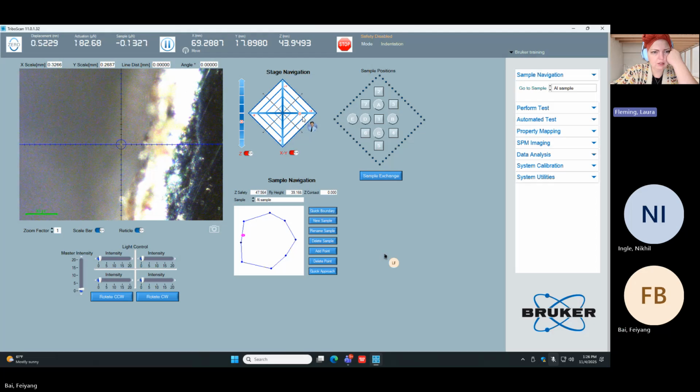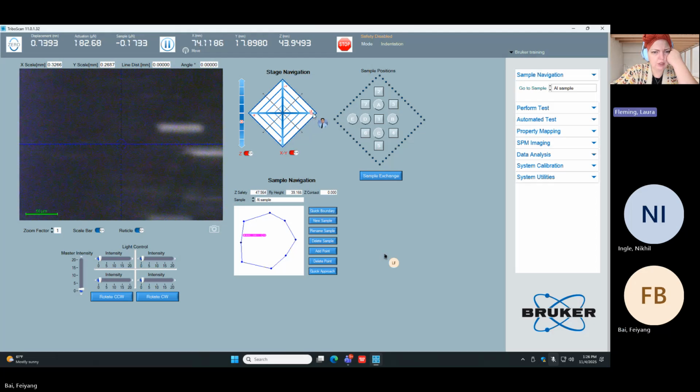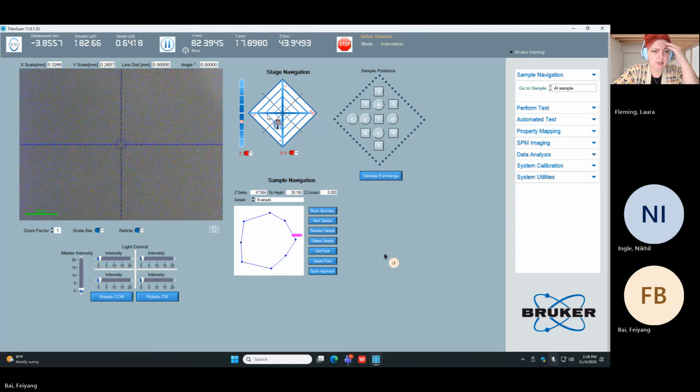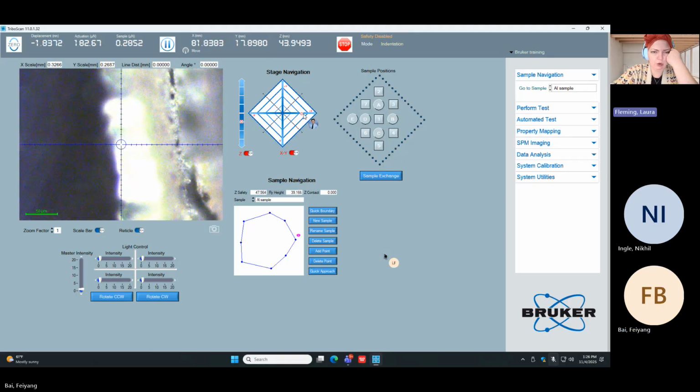Sort of. Okay. Yeah, that one came in a little bit. Okay. And then I think that's as far as you could go on this side. So that looks correct to me. Okay, can we check the fuse quartz corners?